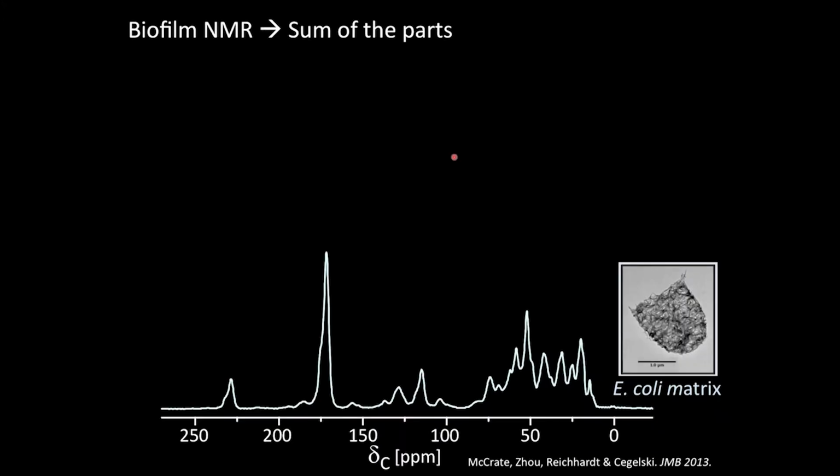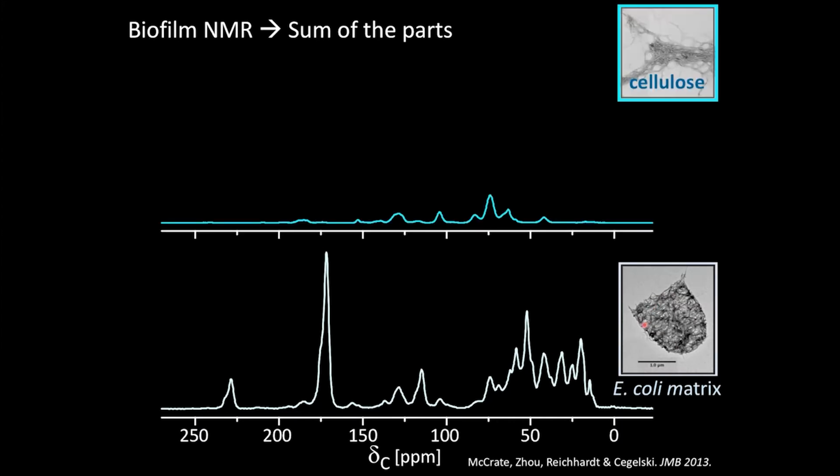So this was where we took a solid-state NMR approach. And this is just simple C13 CPMAS NMR. I'll give a quick primer on that in a second. Natural abundance levels of carbon, about 40, 50 milligrams of material probably was in our 5 millimeter rotor. And here's the carbon spectrum of that intact matrix material collected.